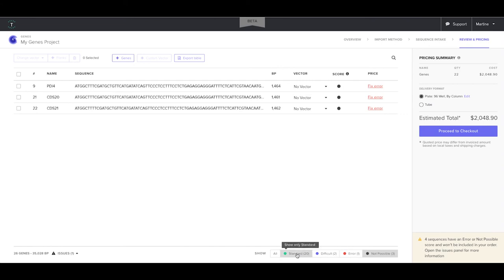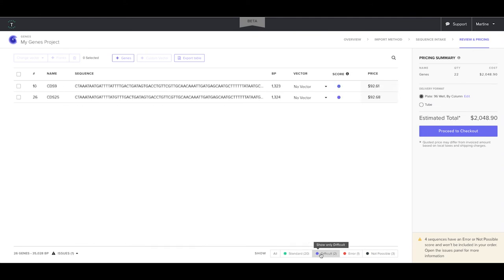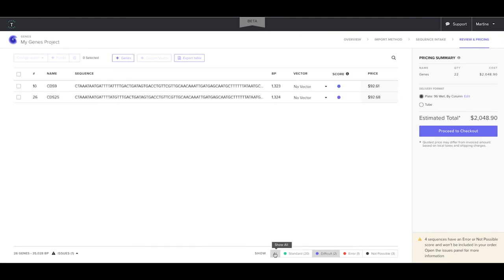Sequences which score as green standard or purple difficult will be included in the order. To order gene fragments, leave the vector column set to no vector.